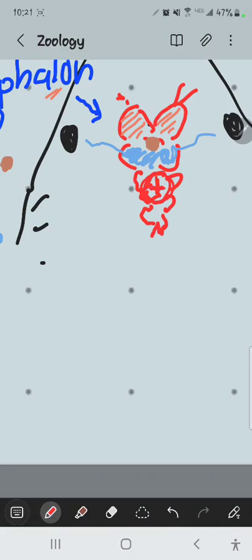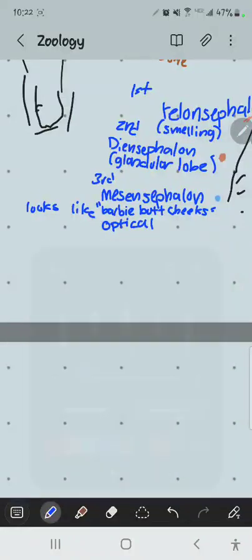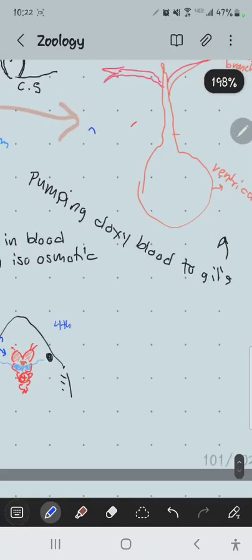So voluntary motor means that if the shark decides to swim to the surface, or if it sees a prey item that it wants to eat, that metencephalon is what coordinates swimming to go there. So body coordination, swimming, behaviors, it's voluntary motor basically is what the metencephalon does.